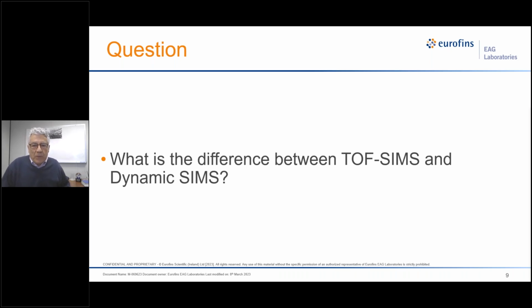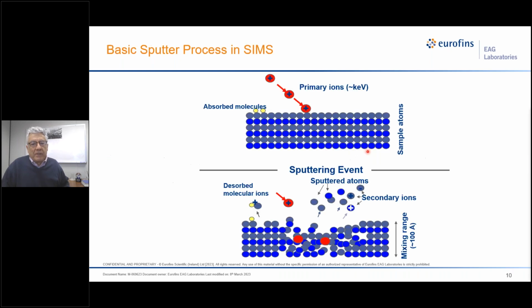So this question that we typically get quite often is in relation to definitions of SIMS. The question was about time of flight SIMS, or TOF SIMS, versus dynamic SIMS. So to really understand this question and have a good comprehensive answer, let me start with giving you an overview of what the dynamic SIMS process is.